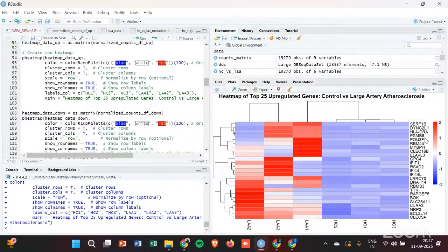You can't really say that, because these are just the gene counts. These are clustered based on the gene counts. They are not clustered based on how well these genes are tied together in a biological process. Just because they happen to have high counts together in one sample and low counts together in another does not mean it has a biological significance. It could, but it does not necessarily. So don't read too much into the gene level clustering, but the sample level clustering you could use as part of your interpretation.